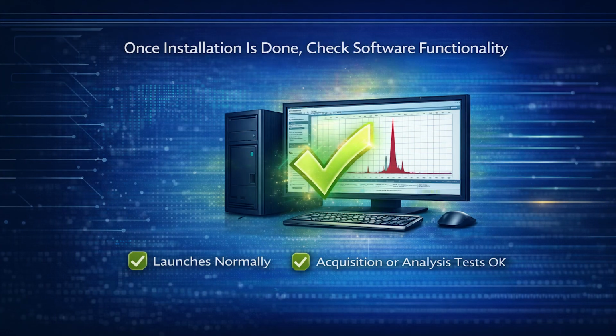Once installation, file access, configuration, and licensing are complete, verify that Chromperfect launches normally and that acquisition or analysis behaves as expected. This completes the installation and migration process for Chromperfect on replacement computer hardware.